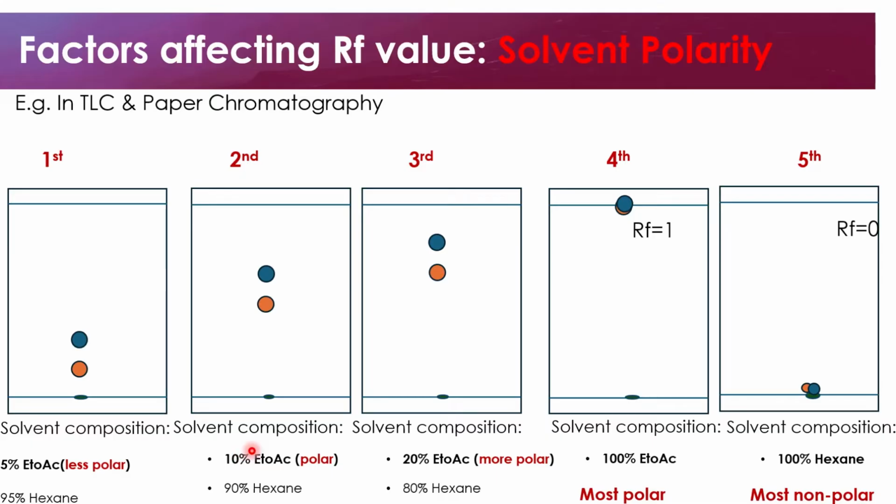Also, the solvent mixture used in the third chromatography will be considered a more polar solvent than the one used in the second chromatography.